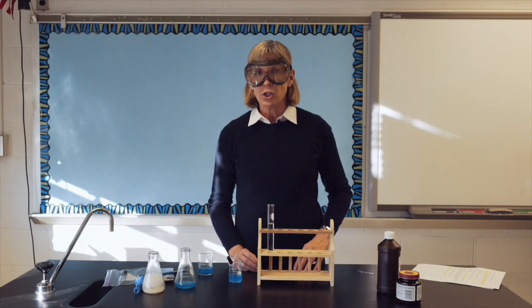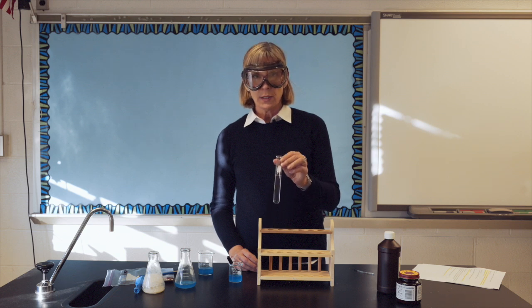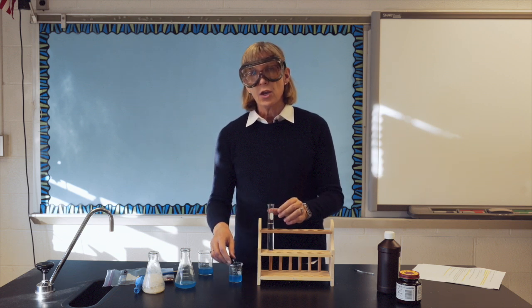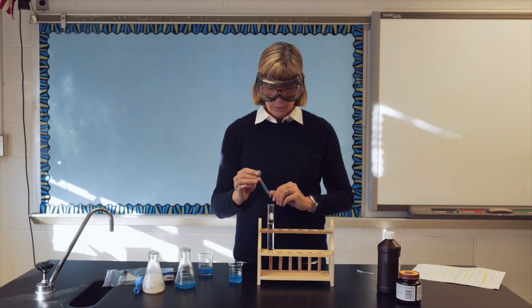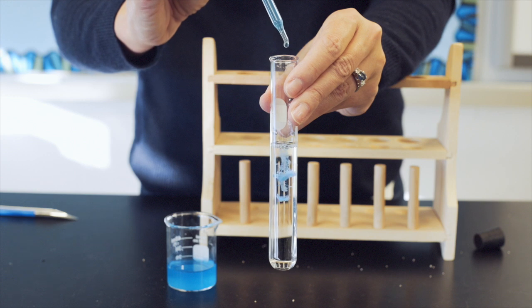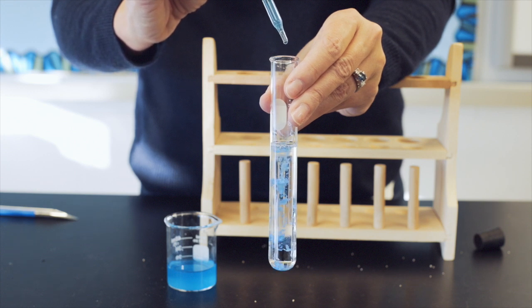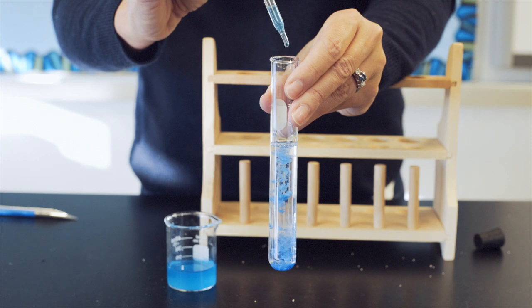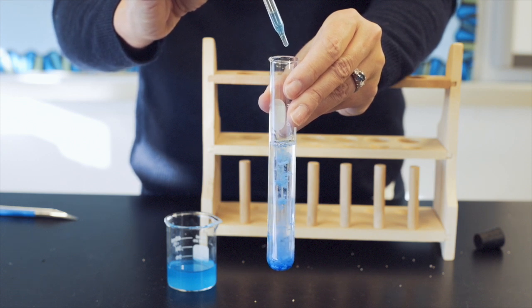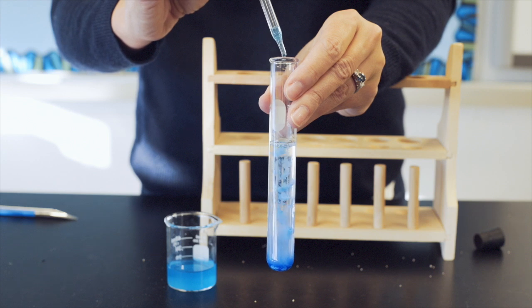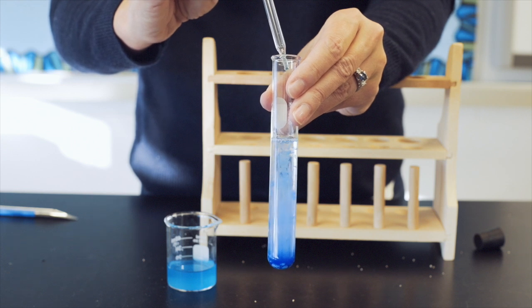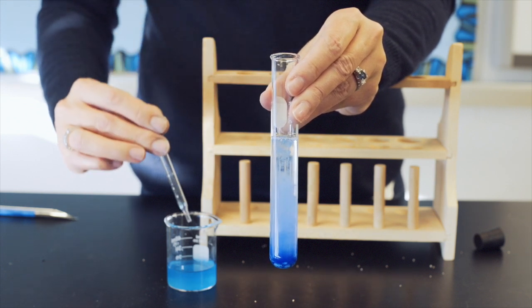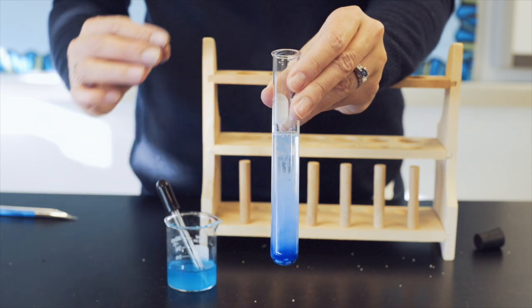Activity D directs you to pour ammonia into a test tube and then add drops of copper sulfate slowly into the test tube. Notice that not only the ammonia changes color, but the copper sulfate does as well. When the two liquids mix together, they form a solid that sinks to the bottom of the test tube.